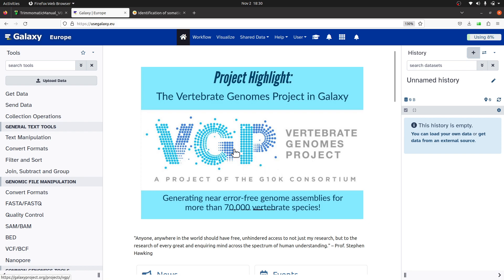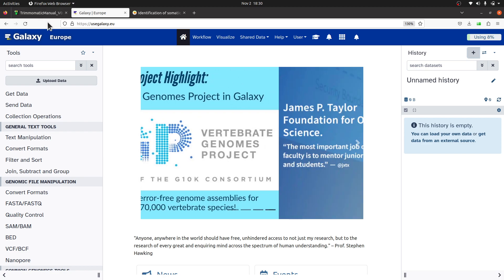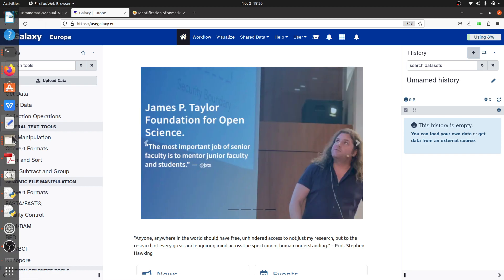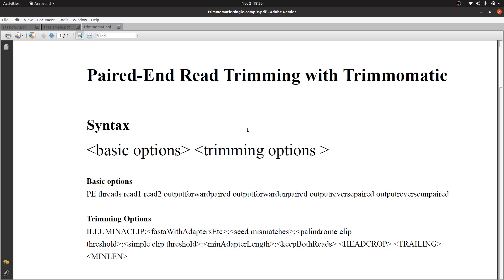Before we start the exercise, let's look at the syntax for Trimmomatic. For this tutorial we are going to focus on paired-end read trimming. I have grouped the syntax into two categories: basic options and trimming options. Basic options are required — you have to specify them. For trimming options, some will have default values, so you don't have to specify all of them.